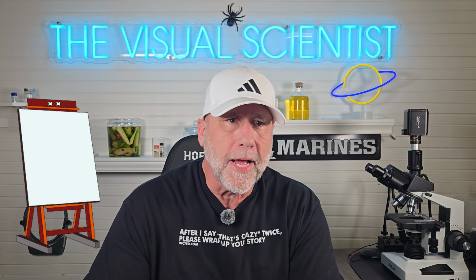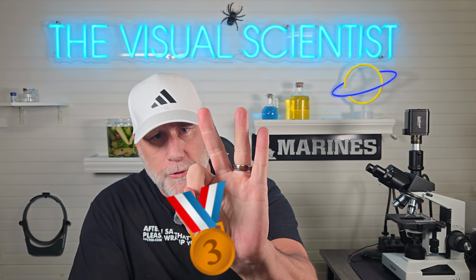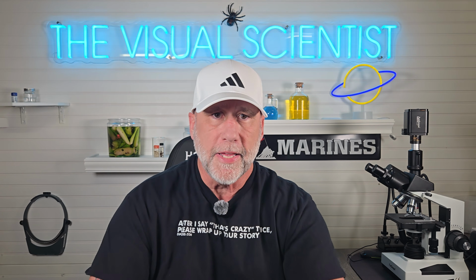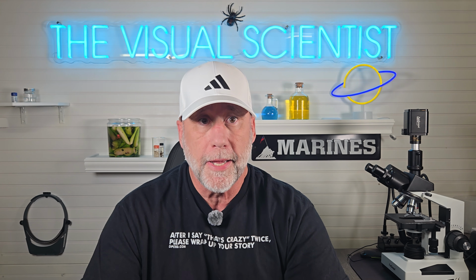What are we actually looking at in real honey? What does the microscope care about? 3 things, you guys. Number 1 is the pollen. Pollen grains are the biological fingerprint of real honey.